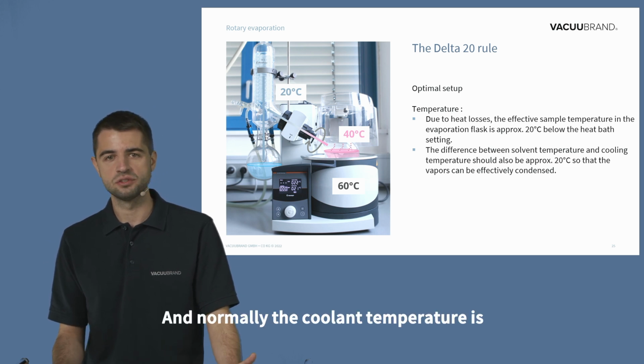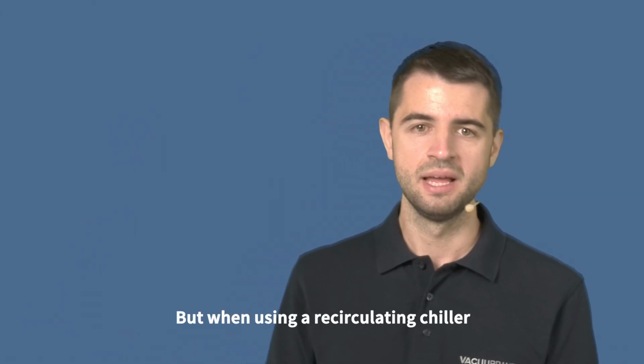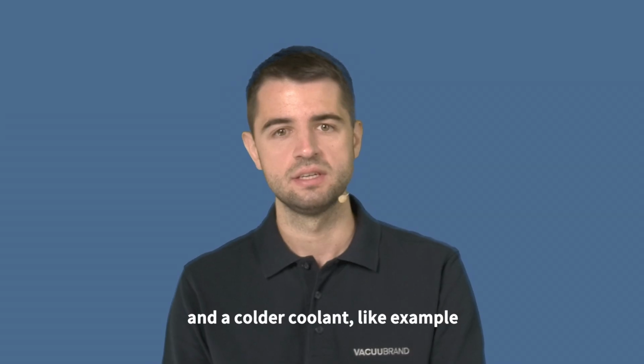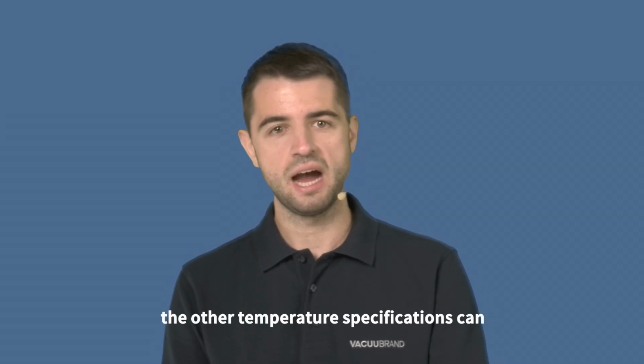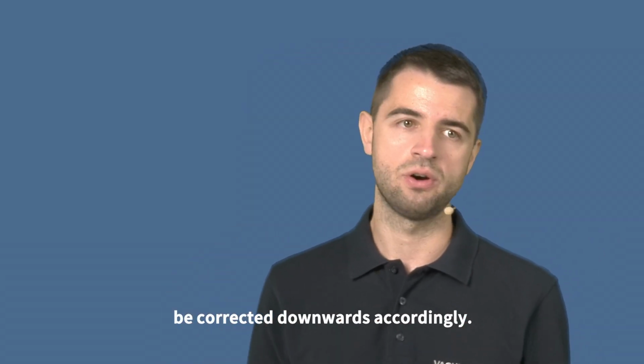And normally the coolant temperature is assumed because we use classic water cooling. But when using a recirculating chiller and a colder coolant, for example something that reaches about 5 degrees, the other temperature specifications can be corrected downwards accordingly.